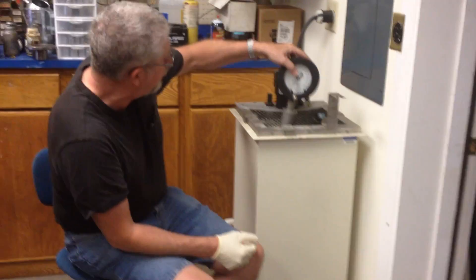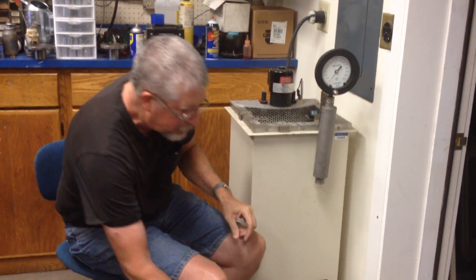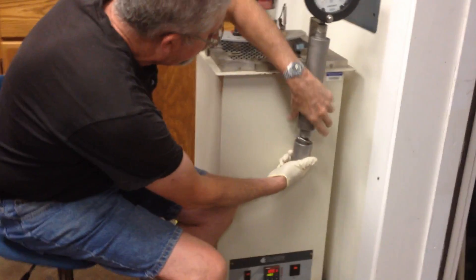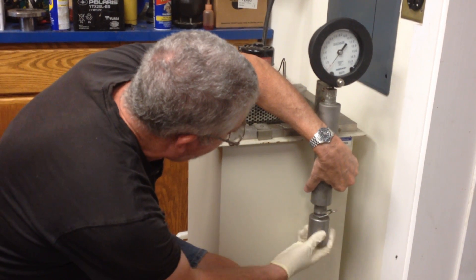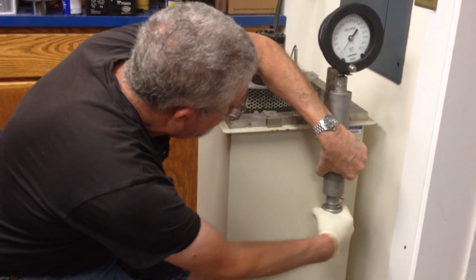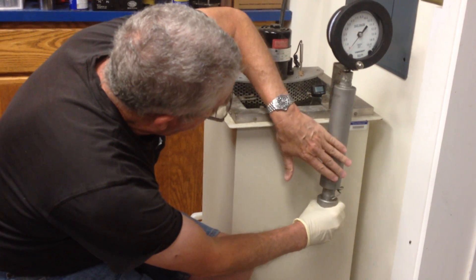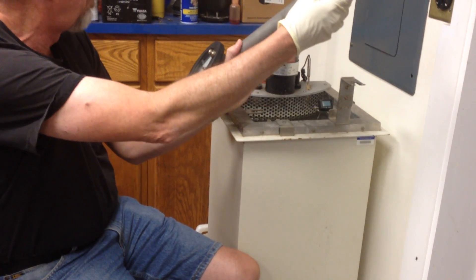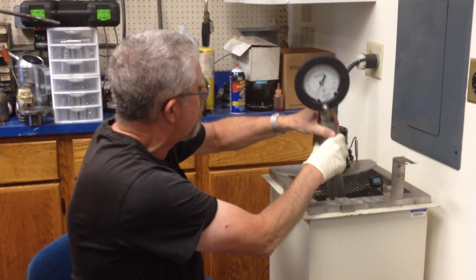We take the preheated test bomb out of the 100-degree water. The chilled fuel sample goes right in there. So there's air up top, fuel's down below. The first thing we do is agitate the fuel so it runs into the preheated chamber and begins the vaporization process.